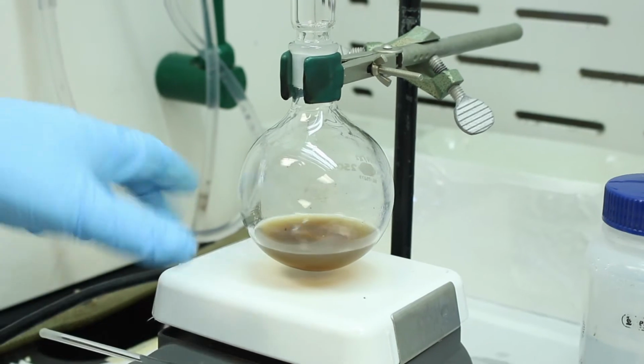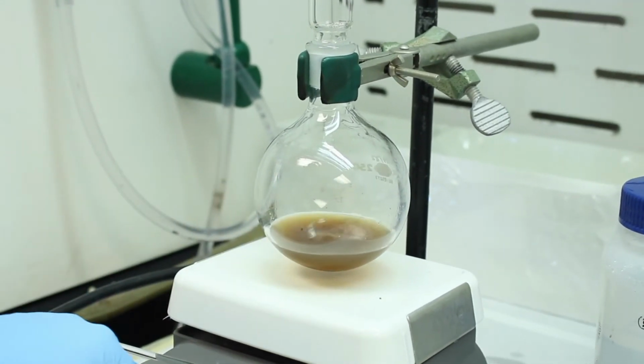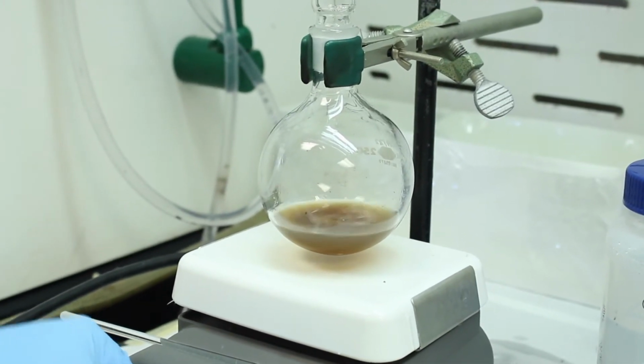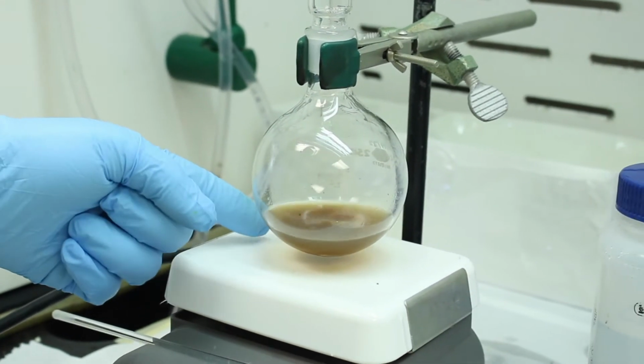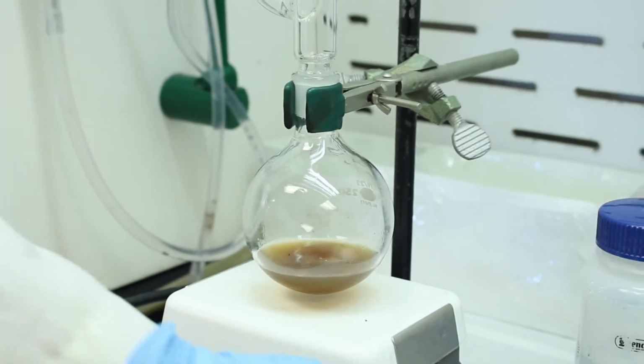Okay, so our Grignard reagent has been forming for about 15 minutes or so, and there's still a little bit of magnesium that's unreacted. That's to be expected though, because the magnesium is in excess. So now that's the formation of the Grignard reagent. In this flask is the phenyl magnesium bromide. Okay, so basically step one of this experiment.